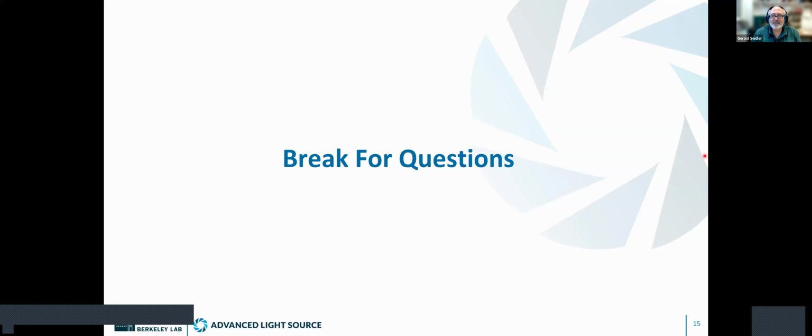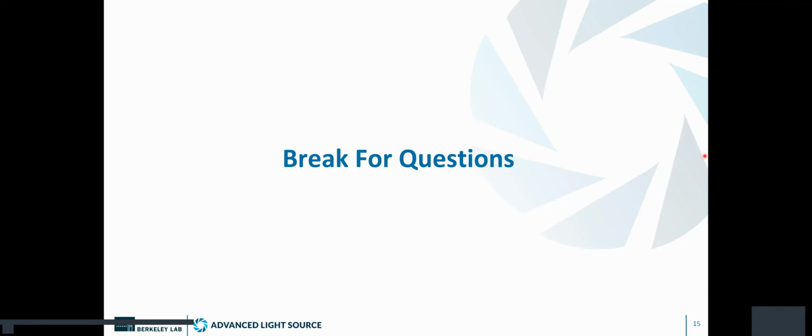Janos, you have the last question of this break, please. Yeah, so it seems like your ultimate resolution is about 10 nanometers. What would it take to go down to a nanometer? That would be very important for catalysis research, because nanoparticles are very important for us. So go to a nanometer and maybe even sub-nanometer. What would it take? What is the main limitation? I'm not familiar with this technique, so it's a naive question, but I would like to know.